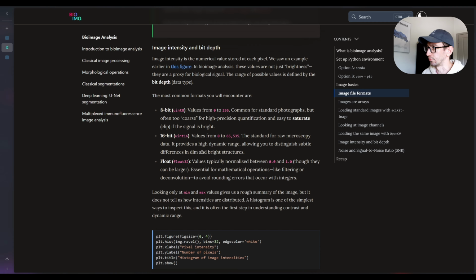But you need to be cautious about that, and remember that if you have, for example, a weak signal for a particular antibody, it can be lost in the final image if you convert from 16-bit to 8-bit. Not all the time, but in rare cases it could happen.